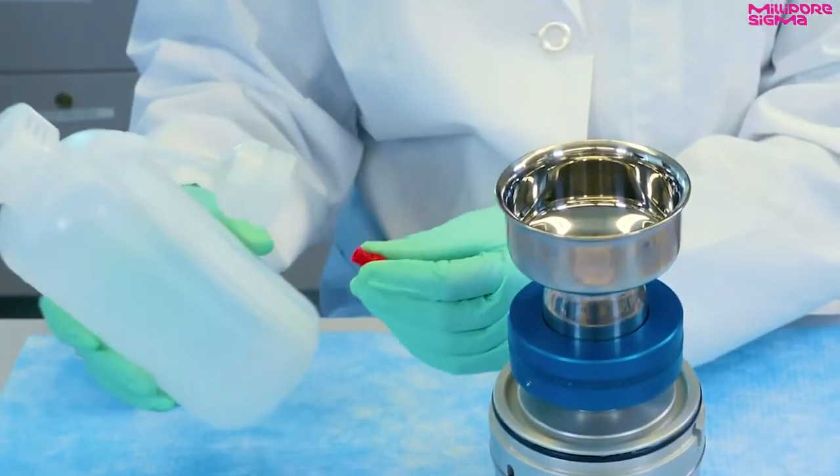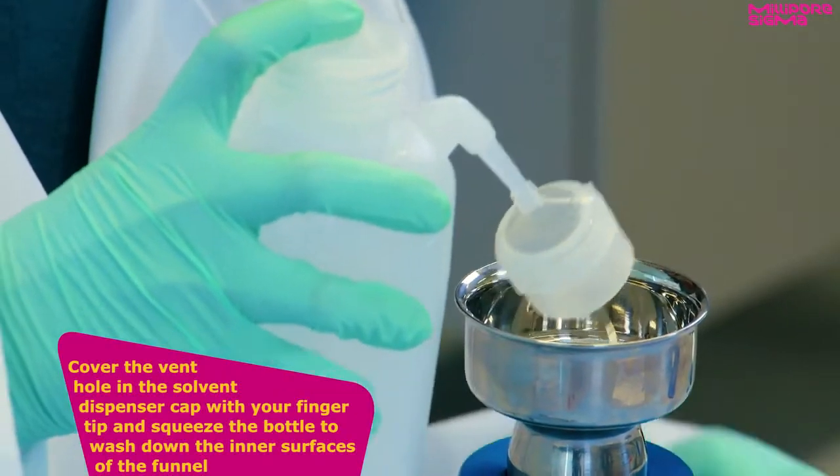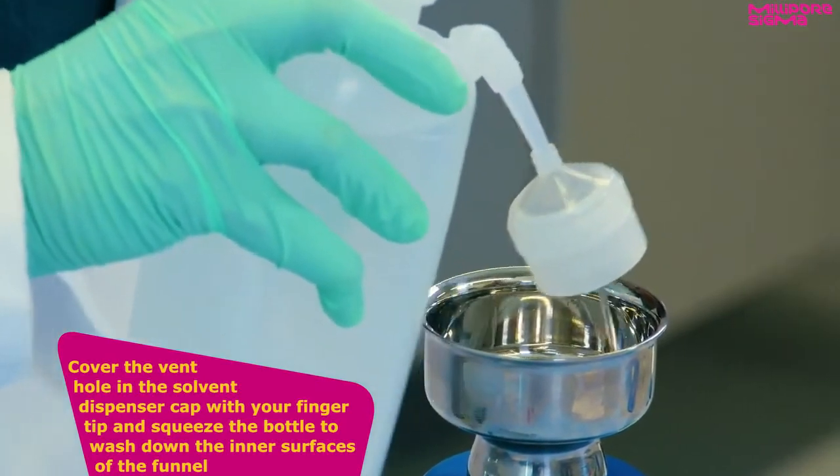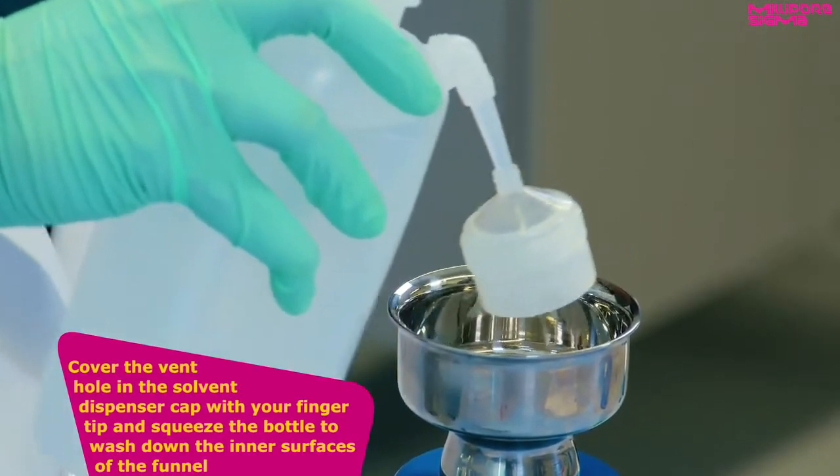Remove the red cap from the wash bottle. Cover the vent hole in the solvent dispenser cap with your fingertip and squeeze the bottle to wash down the inner surfaces of the funnel. Make sure to use enough solvent to wash all the contaminants into the flask.